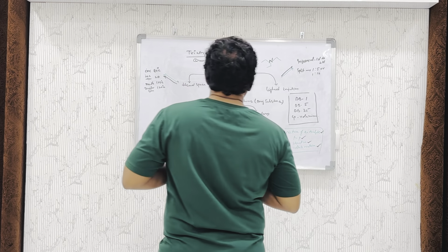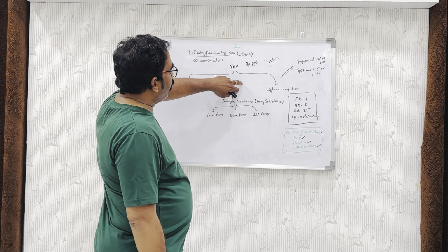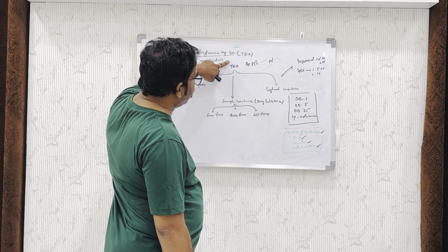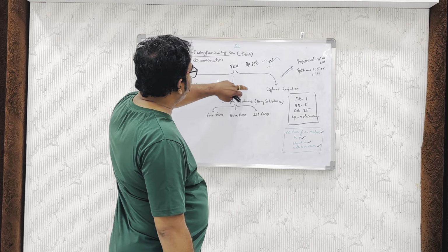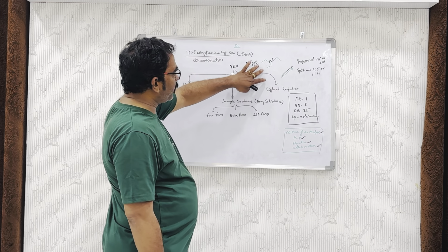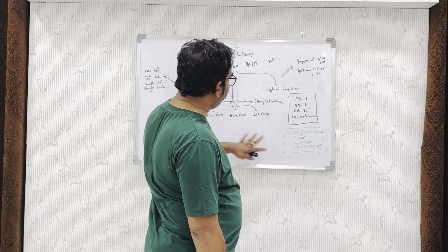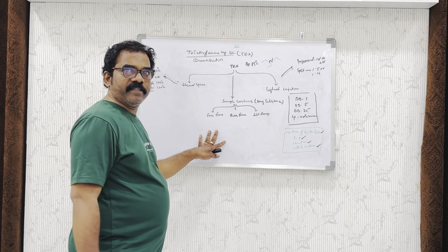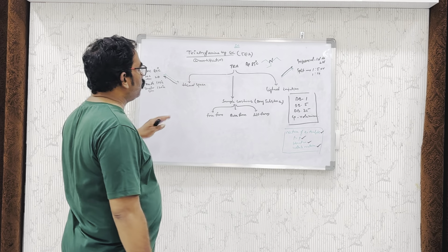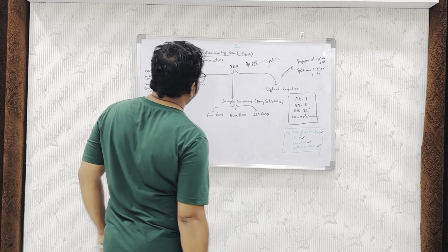First of all, we'll take triethylamine, TEA. The nature of the analyte comes under basic nature, and the boiling point is 89. This is the structure, and volatile nature means it will easily volatilize by gas chromatography, and it will give a very good response by GC.